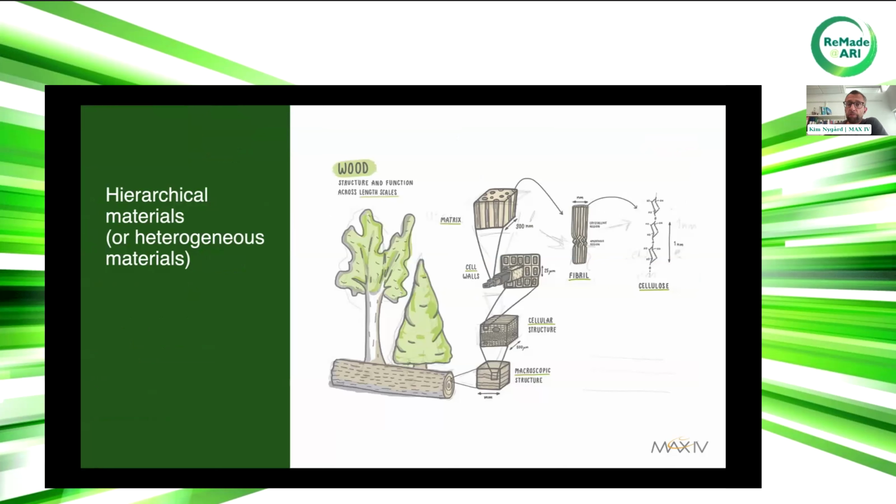Okay, we're going to talk about multiscale structural characterization. And to set the scene, I thought I'd briefly introduce hierarchical materials, as we physicists like to call them. So many materials in nature, and many synthetic materials, are what we call hierarchical, meaning they have important structure at many different length scales that govern some of the material's properties.